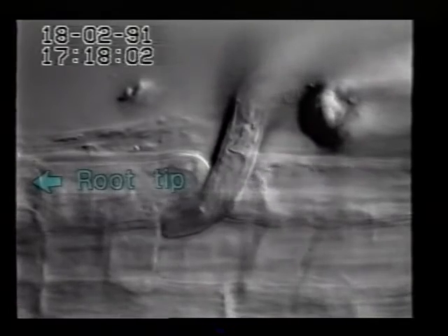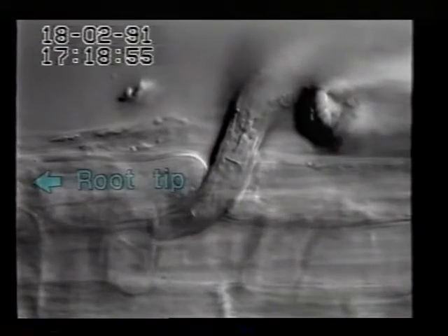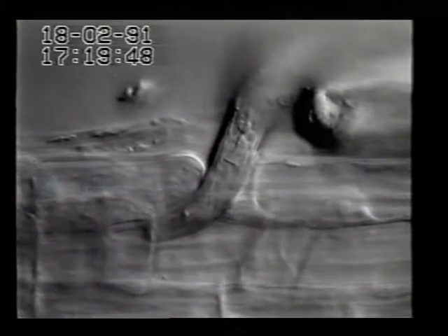The intercellular space is now widened and the nematode has already pushed its head into it. It now enters the intercellular space and starts to migrate towards the root tip. Intercellular penetration obviously did not cause any damage to the rhizodermal cells. Juveniles which penetrated the root intracellularly leave the cells which they have entered and also proceed migration within the intercellular space.